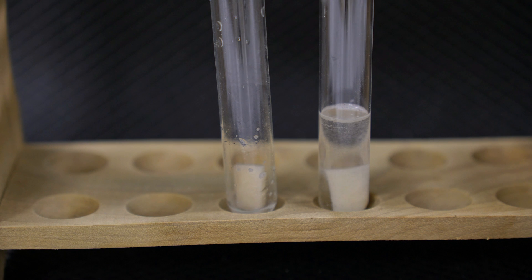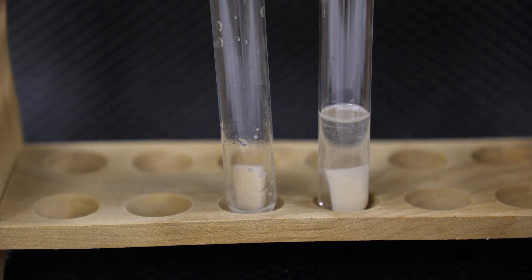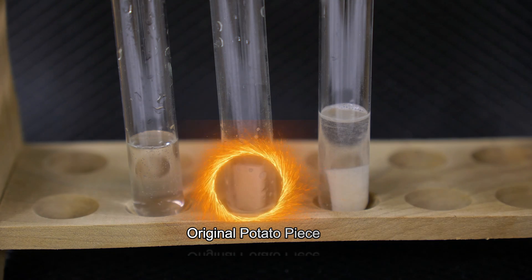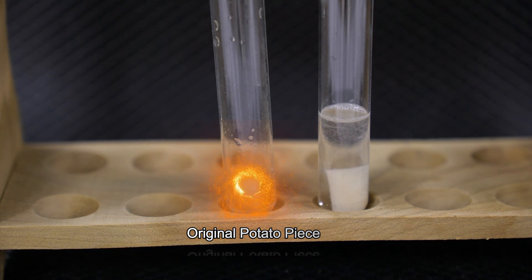Now, in contrast, we're looking at that first piece of potato. What I have now is a fresh 4 mL of hydrogen peroxide. I'm going to add it to our original potato and see what happens for a reaction.